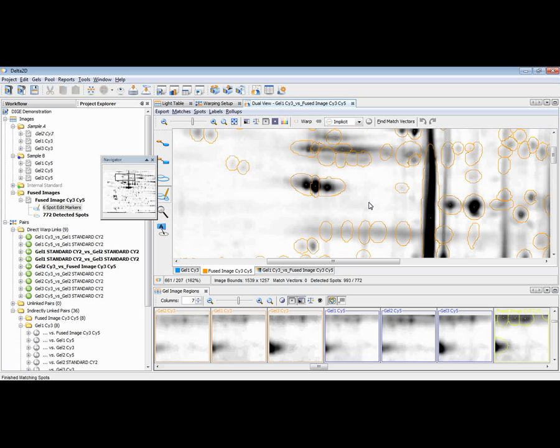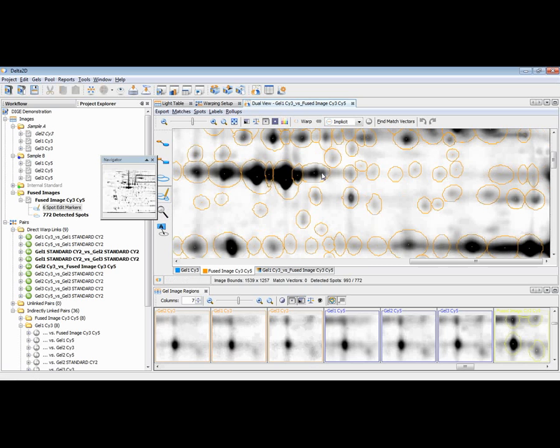So this way, do it systematically, invest the time which is necessary to do this, and make sure that you did not forget a certain region on the image. Invest some time, because you save a lot of time, since you have to do this only once, regardless of the size of your experiment. So even if you have 50 images in your experiment, or maybe 150, you just have one fused image on which you do the spot detection and optimize the spot pattern then.